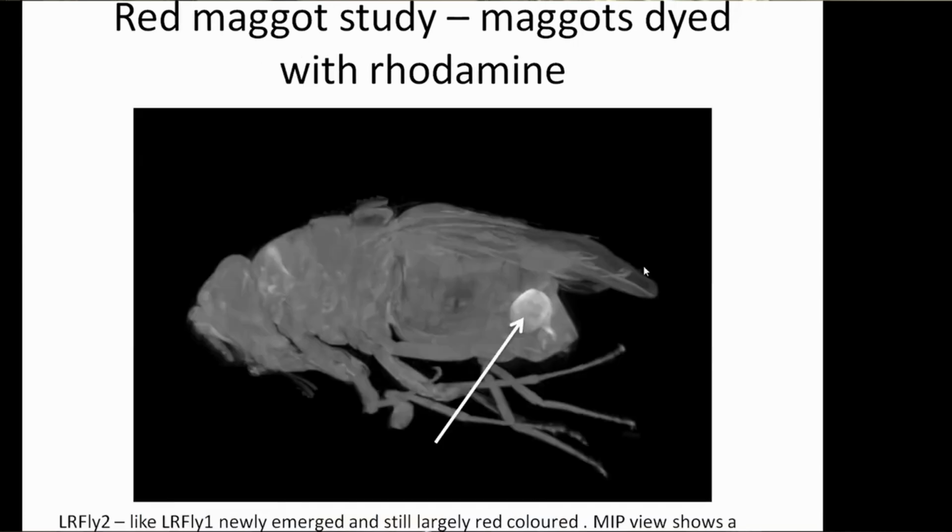But we were interested in the fact that a lot of the flies were, if you like, constipated. They still had a lot of material retained in their bowel, and as you'll see in a moment, some of them had material still left in their kidneys, which none of the flies that weren't treated with this dye were. So I'll rattle through those.